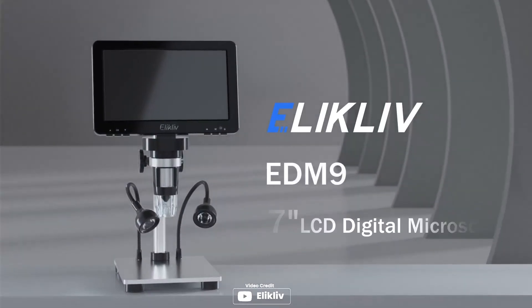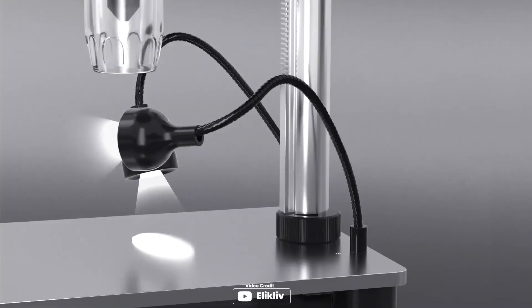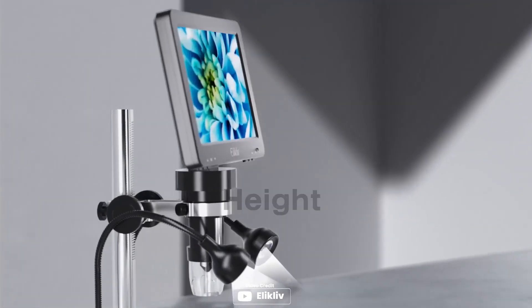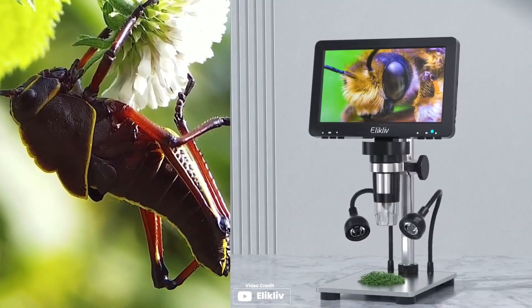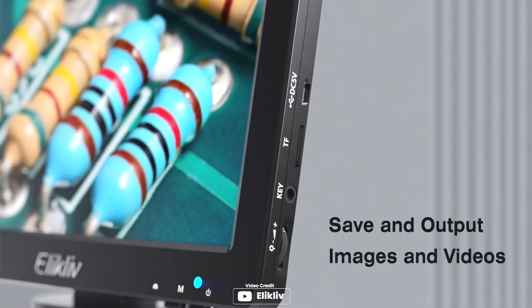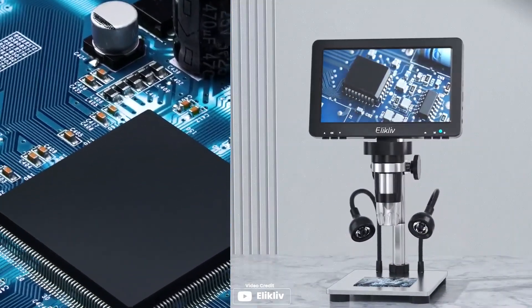Are you looking for a microscope that can be used for a wide range of applications? Then the LXLIVE EDM9 7-inch LCD digital microscope may be just what you need. The 7-inch rotatable HD screen is convenient for easy and accurate observation from different angles. This microscope also allows you to zoom with a magnification range from 10x to 1200x, and the 10 LED light design ensures clear and bright specimens. You can even take pictures and record videos and save them to a microSD card, and with its ability to connect to a PC, you can observe on a larger scale for data sharing and analytics. Pros: it's perfect for a wide range of applications.